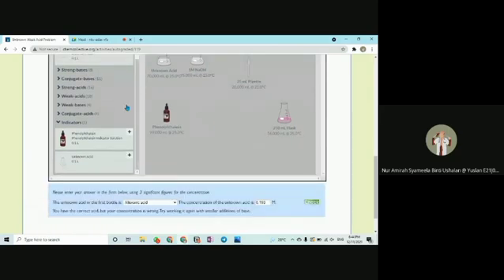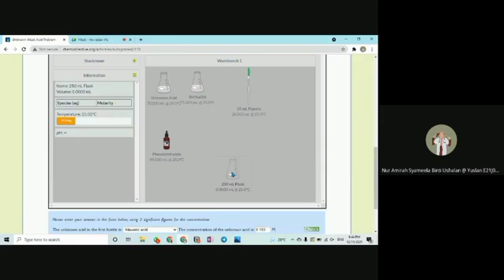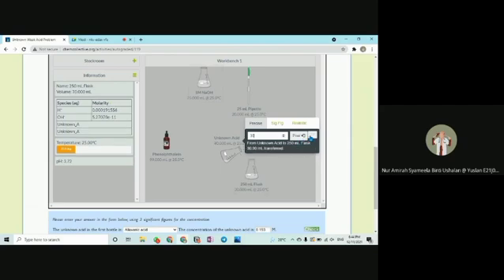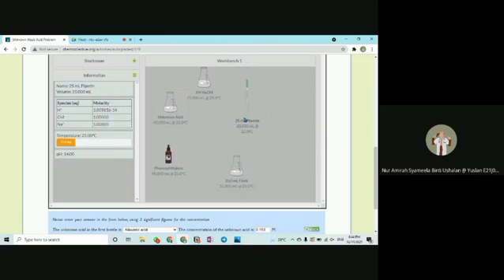So we once again can just empty the flask and pour in again the same amount of acid as before. And we cannot forget the phenolphthalein, which is the indicator. Alright, now we will proceed with the titration.